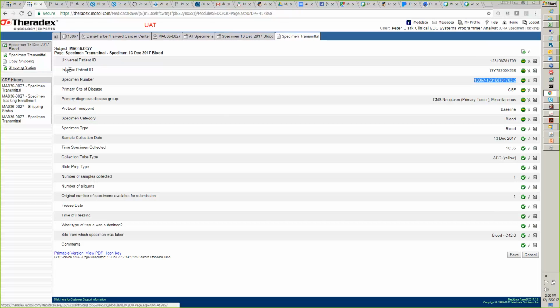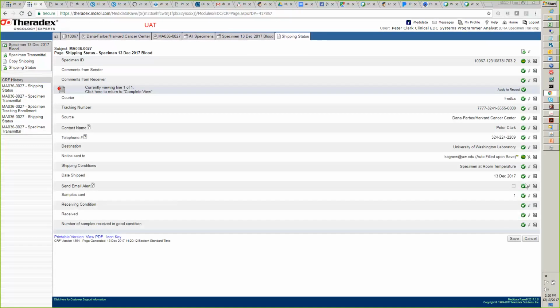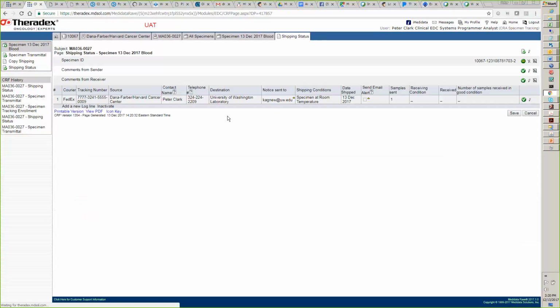Thank you. You're welcome. And we have the shipping status form here, and I'm going to once again, and Kathy, you'll notice your email address already in the form. Okay. And I'm just going to update this form and click the edit pencil on the send the email alert. And I'll click save, and it's going to send you an email, which will have 2 specimens in it instead of just one.